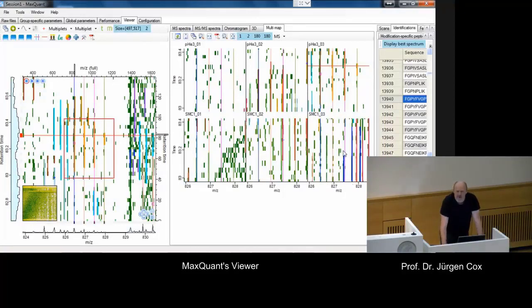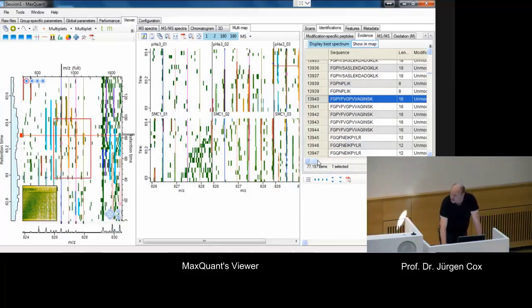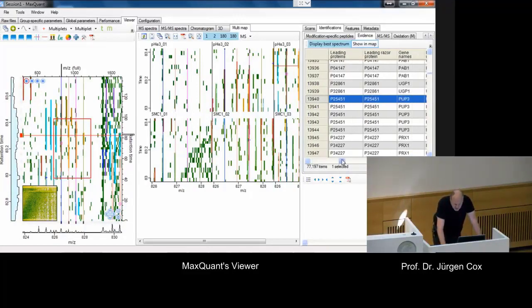That doesn't really look very nice because we're looking at a very low abundant feature, and due to the lack of retention time alignment, that's probably somewhere else in all of these runs. So maybe we go to a more high abundant feature. But I'm sorry, is it recalibrated already, time and mass to charge? Yeah, not here, but one can switch between aligned and not aligned data. But let's first go to a better defined, more intense feature.